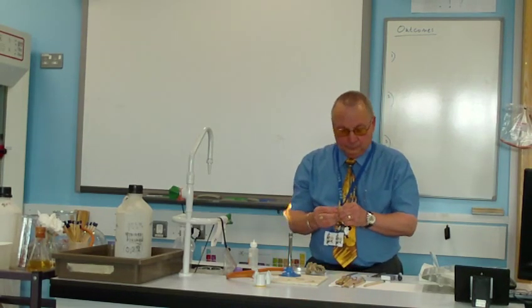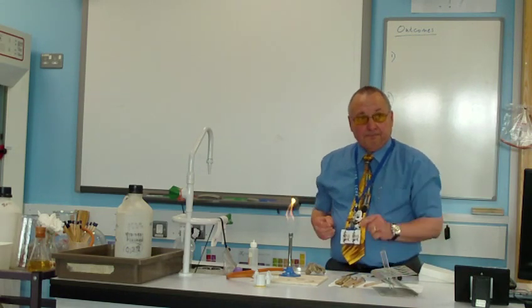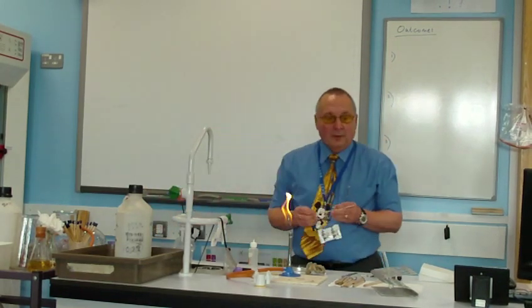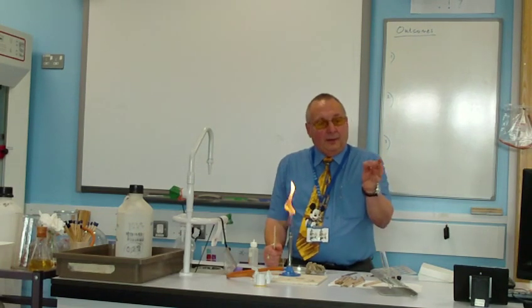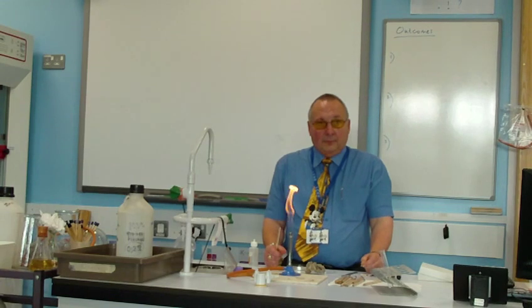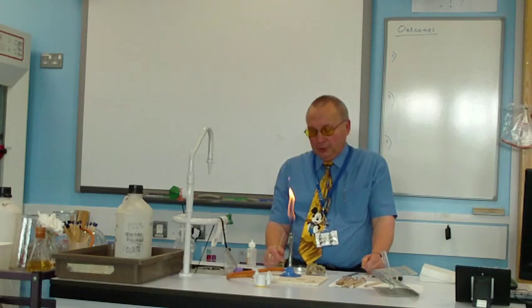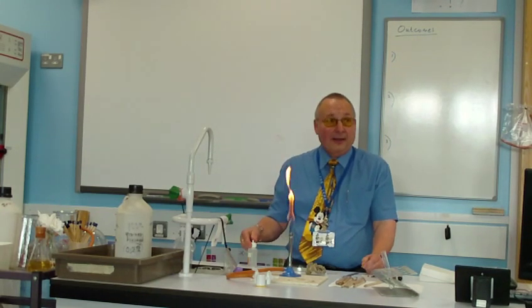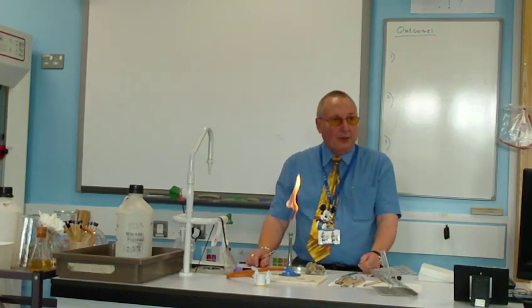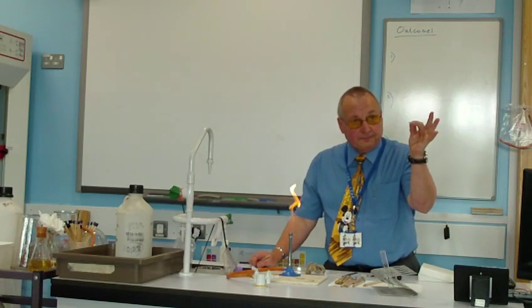Now, in there is some acid. When you put this magnesium in, it will do the same thing as what these reactive metals did with water. What gas will it make? Hydrogen. And if I mix hydrogen with air, what does it do? It pops.